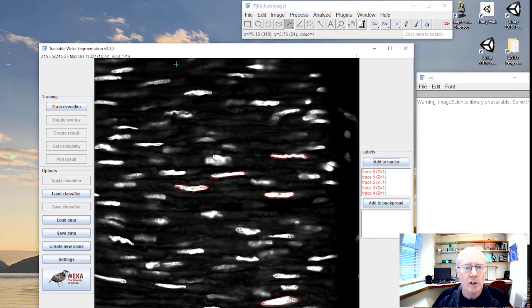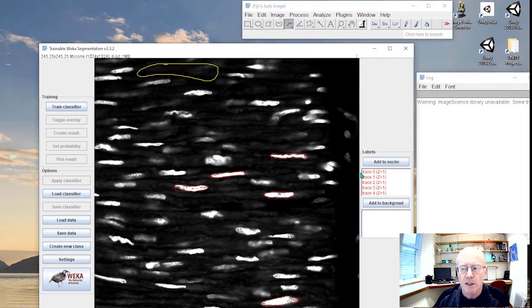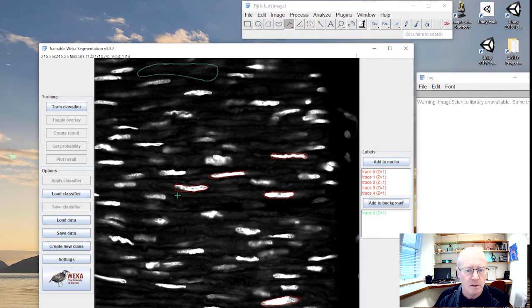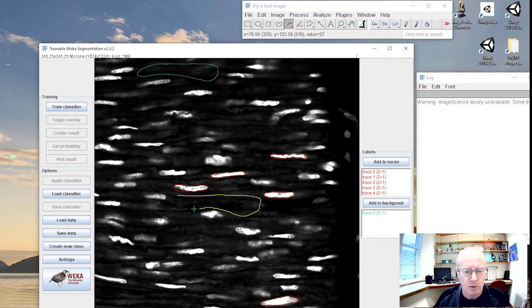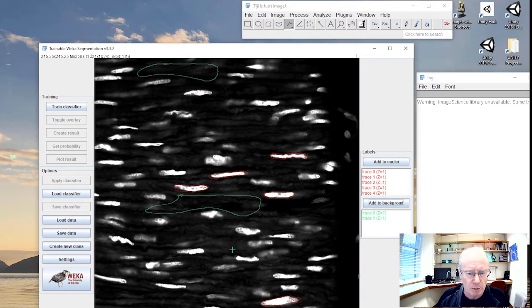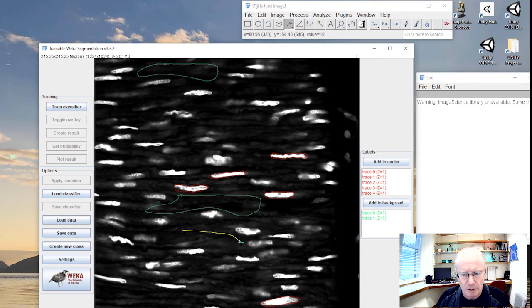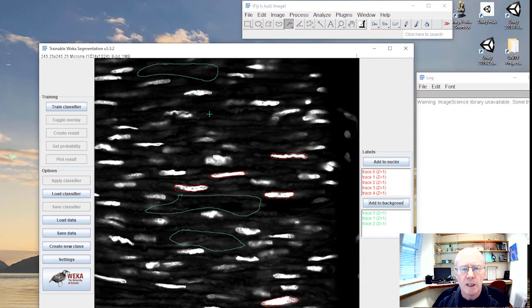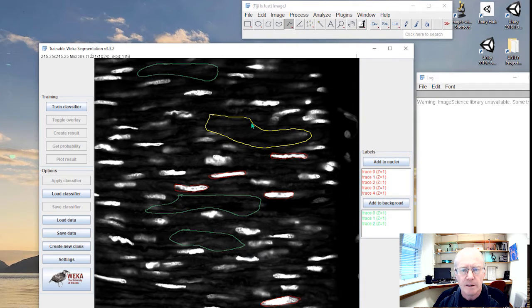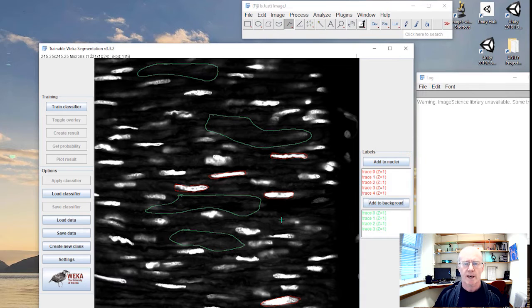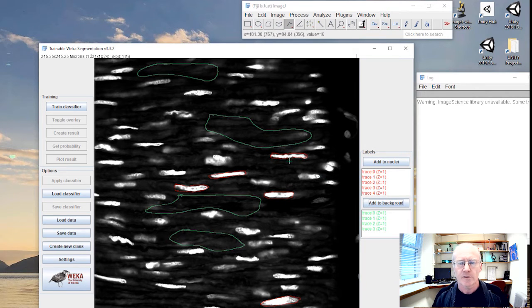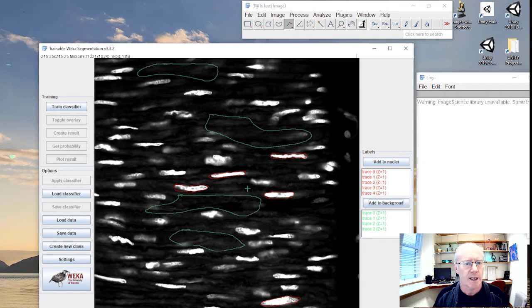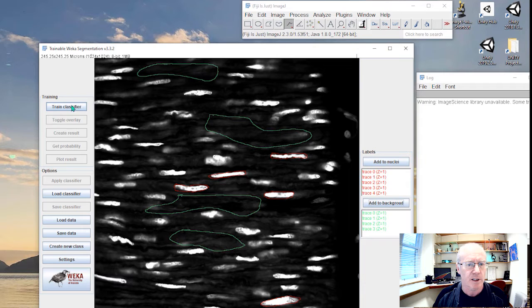Let me now identify some areas of background. So all of this is background. All of this is background, although actually it's cellular, sort of cytoplasm, but those intensities I would prefer to have identified as background. Maybe these quite bright areas will have as background as well. One more area of background. Let's go with that. So I have identified five different nuclei as one label, four areas of background. Let's train this classifier.